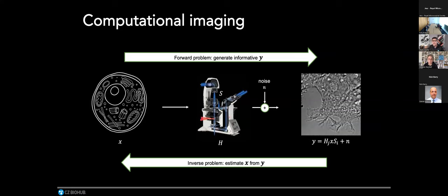So this has been our strategy as we have been thinking about how to make new measurements. We have been designing simpler and simpler hardware and delegating the complexity to the algorithms.